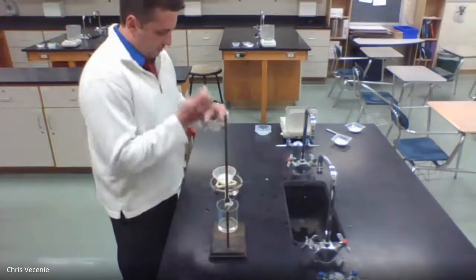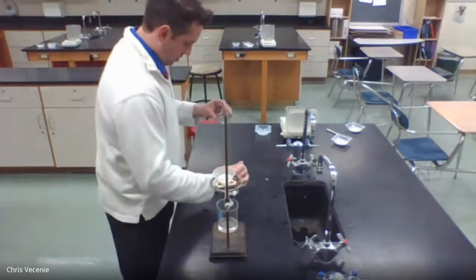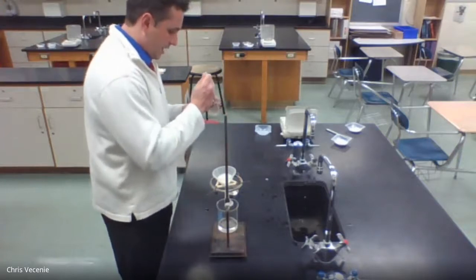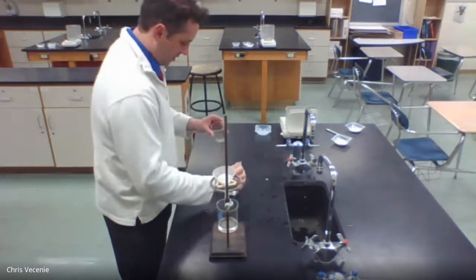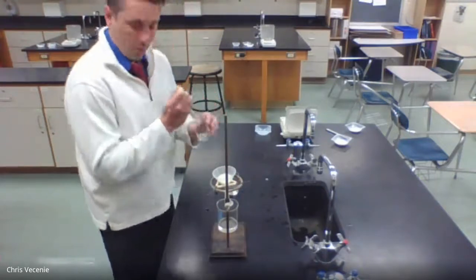I will have to get just a little bit more, because when I rinse that guy down the side, you're going to find out there's some good stuff in there that we want to filter.